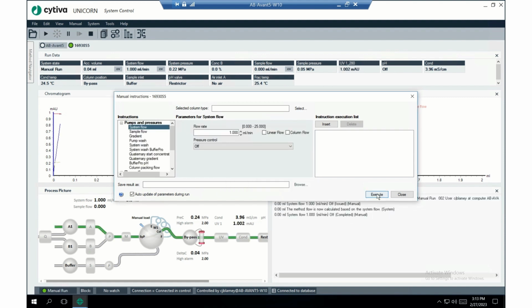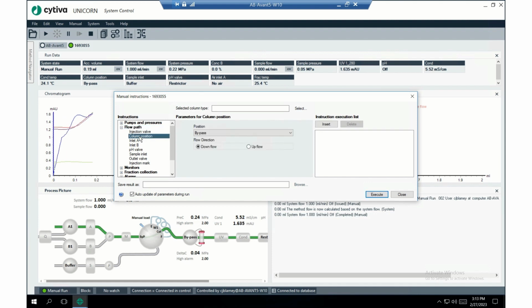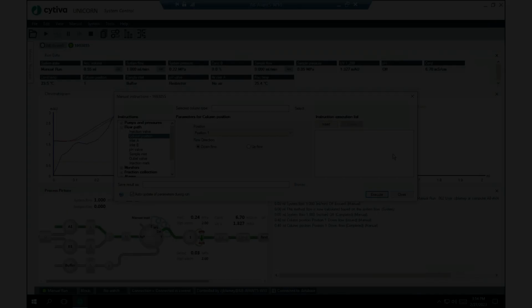And then we're going to go to the flow path radio button. Flow path is right here under pumps and pressures. And then we're going to select the column position, and we're going to select position 1. Now right now there is no column connected to the system. For the flow direction, we're going to select downflow. This will cause liquid buffer really to come out of the top of the column valve.